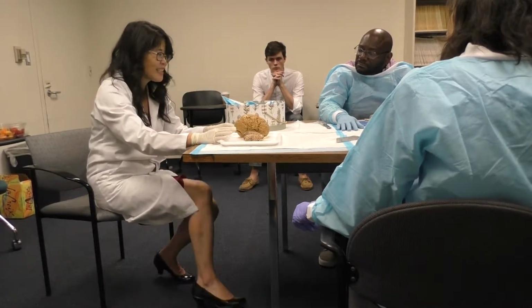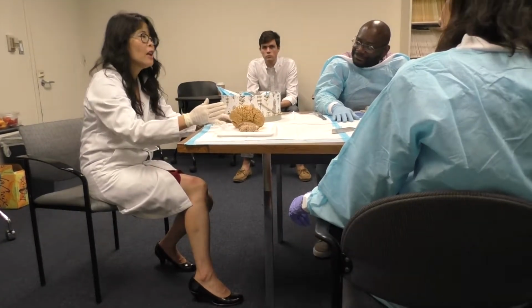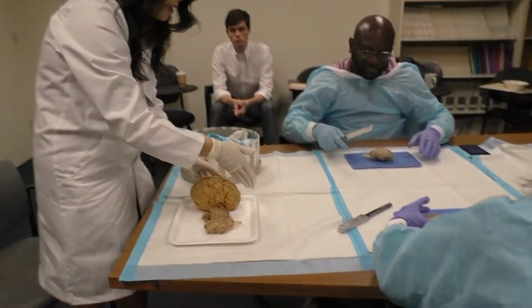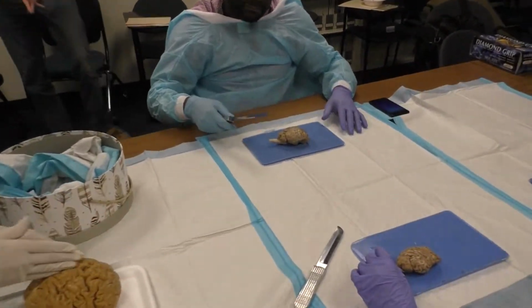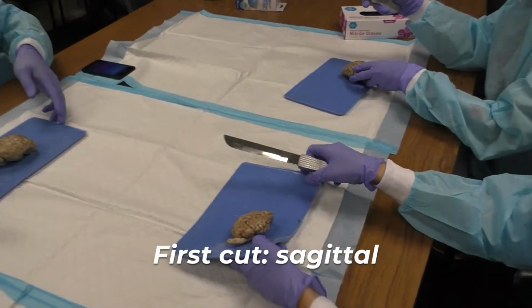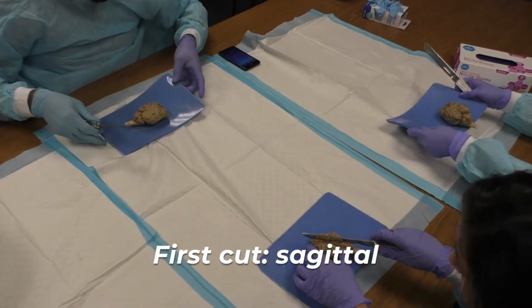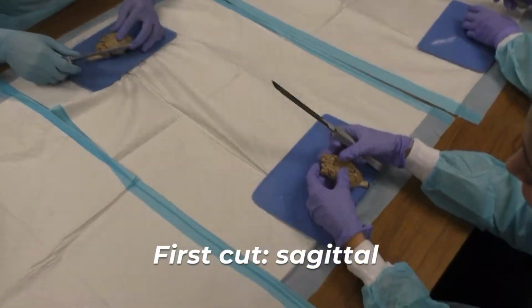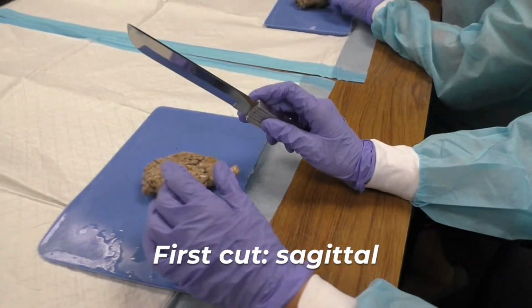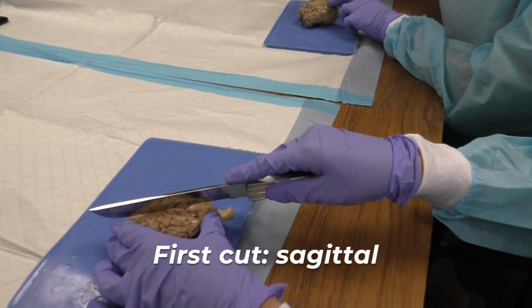And for dissections, it's also great because it gives us a perfect first way to cut the brain. So why don't you take your knives and try in a nice smooth cut to go from the front all the way to the back, and we'll take our first look inside. Okay. Watch your fingers. Try not to saw. My recommendation is to cut like a birthday cake. Like birthday cake, exactly.